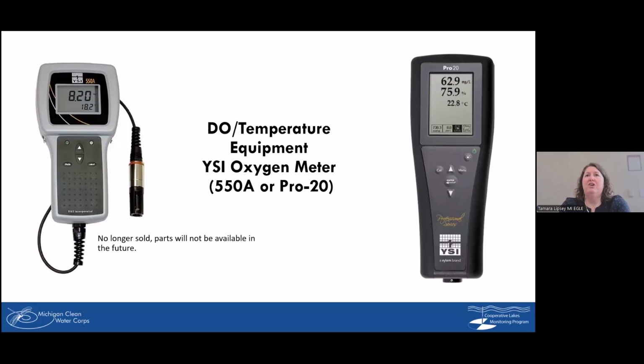The newer meter is called a YSI Pro 20, and if you're borrowing a meter, all of our meters are now Pro 20s. They have some advantages. They're a little quicker to calibrate, and they're just a little less finicky overall.